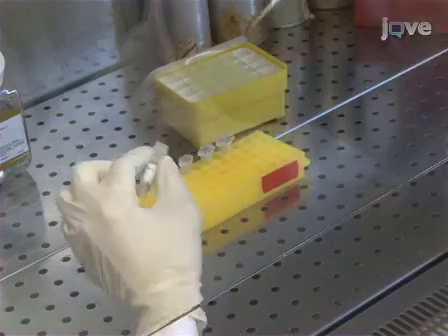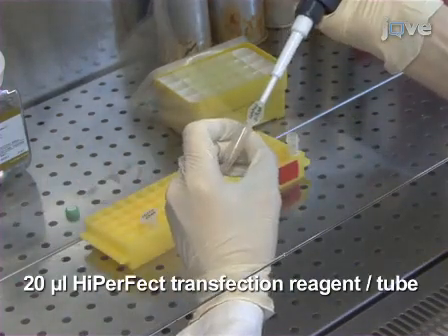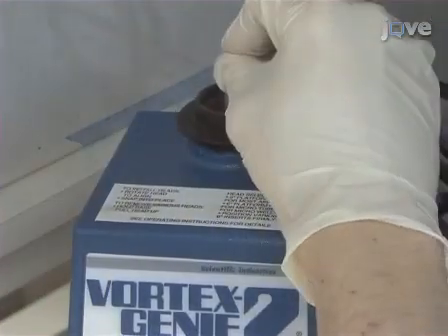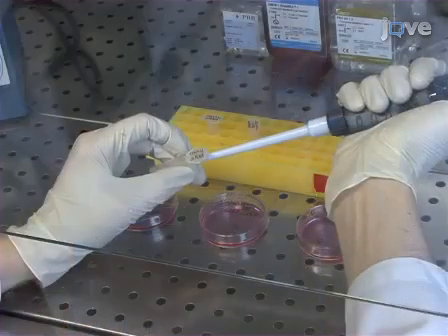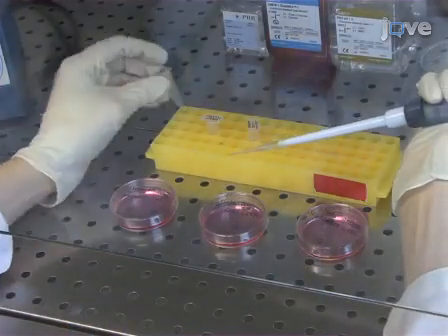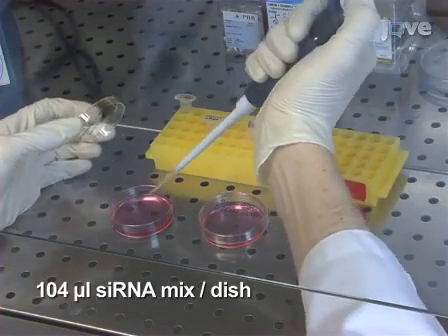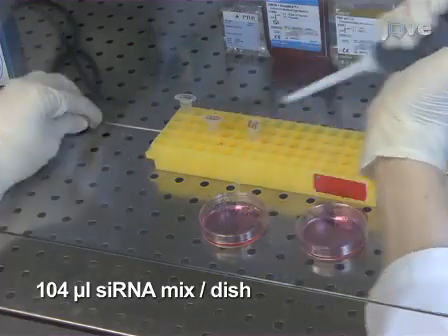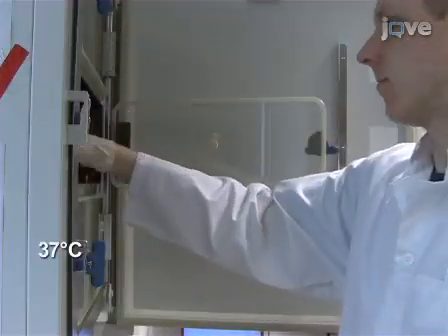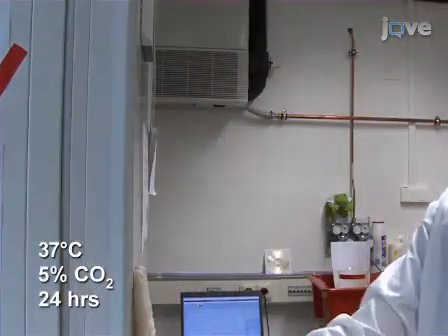To each tube, add 20 microliters of HiPerFect transfection reagent. Gently vortex, then incubate the reactions at room temperature for 10 minutes. To transfect the cells, add the siRNA mix, 104 microliters in total, dropwise to the seeded HeLa cells and gently swirl the dish to ensure uniform distribution of the transfection complexes. Incubate at 37 degrees Celsius in a humidified environment with 5% carbon dioxide.